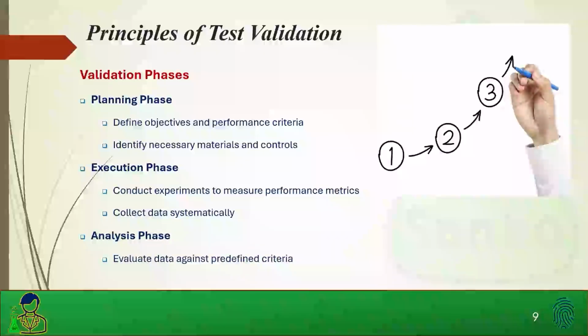So it's important to define your criteria before with your validation plan. So you should have your target. You should know what you're going to try to achieve before you start your validation. It's an important metric. And then identify any potential limitations or anomalies. So the whole purpose of validation is to show that your system is working properly, but you can also identify any limitations. If there are limitations, that's not a problem, as long as you have it documented and you know what your limitations are. When you're testing patient samples, you're not going beyond the limitations of your assay. Every assay has limitations.